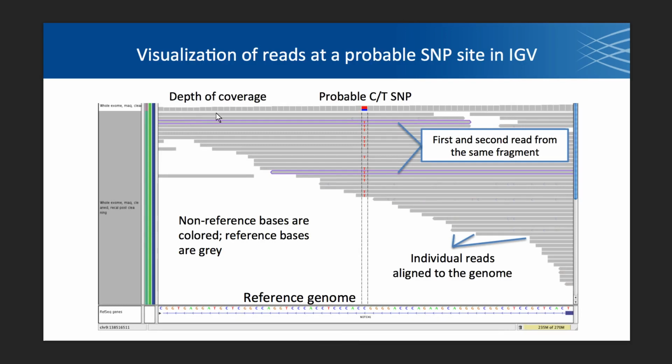Here we've highlighted in purple 2 reads that belong to the same pair. Yossi said that our target fragment length is about 400 bases, but we'll see some that are smaller than that. So, for example, if you had a fragment that was only 250 bases and you're doing 100 base sequencing, you'll see, nope, not with that math. So if you were doing 150 base sequencing and you had a 200 base insert, then you would see some overlap in those reads, which is what we see in this figure here.